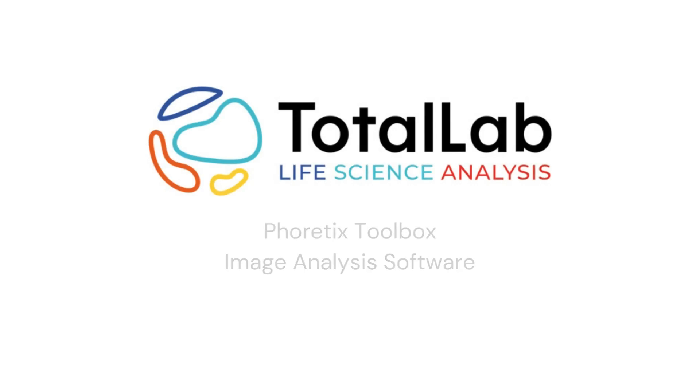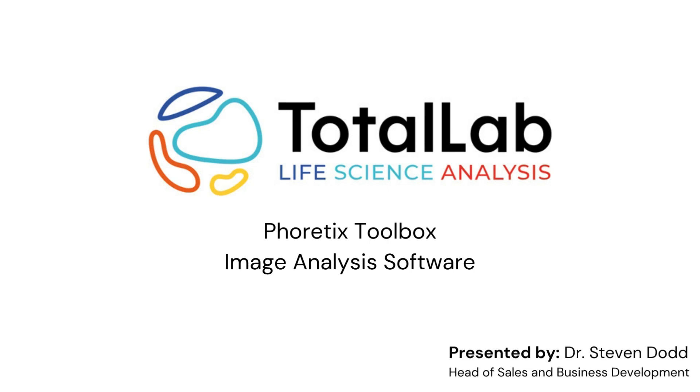Today I'm going to be guiding you through our new Phoretics Toolbox Freeform Image Analysis Software.